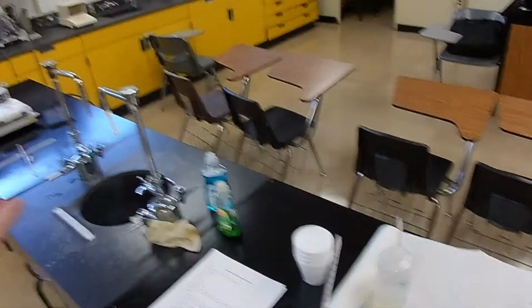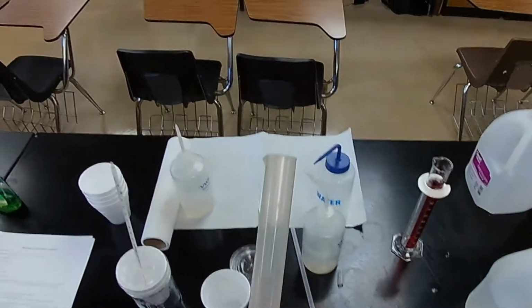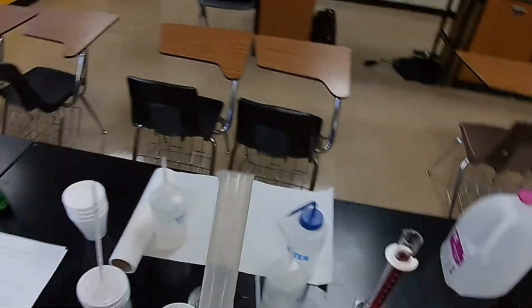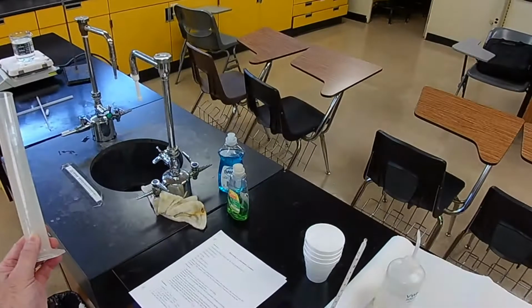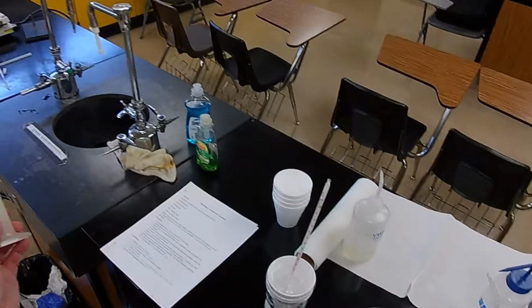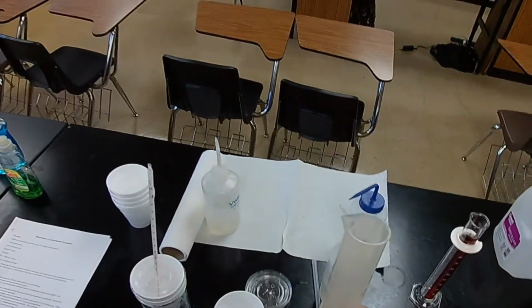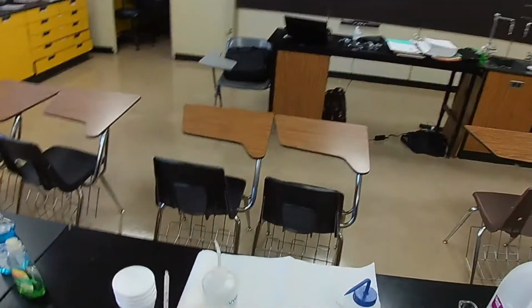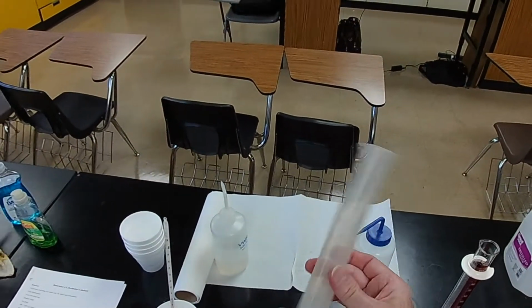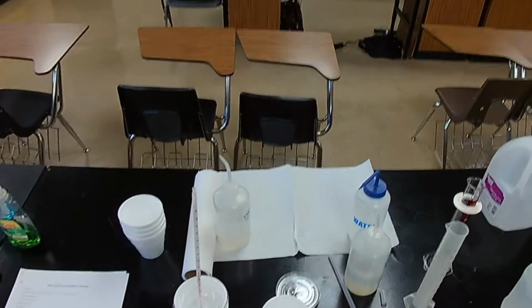So when we add that hot water to this, actually it would be better to use this. The water won't cool down as much in plastic as it will in glass. So we'll use this one to measure the hot water, 75 milliliters, same as the cold water. And then we're going to take that 75 milliliters and pour it in here. And then we'll measure the temperature in the styrofoam cup, not in the graduated cylinder. We want to know the temperature of the hot water immediately before we combine them.